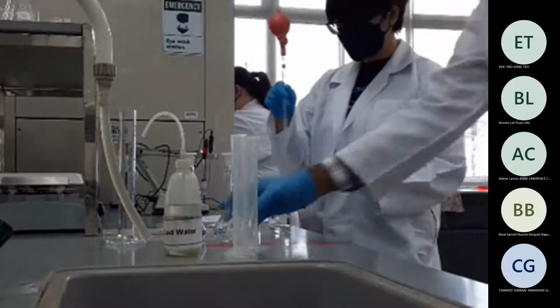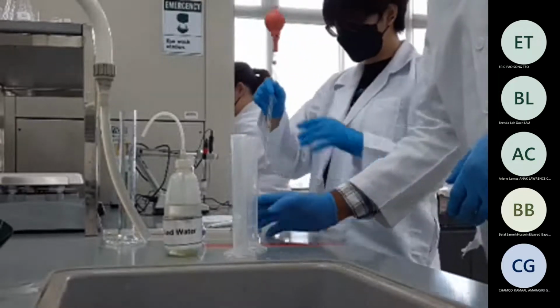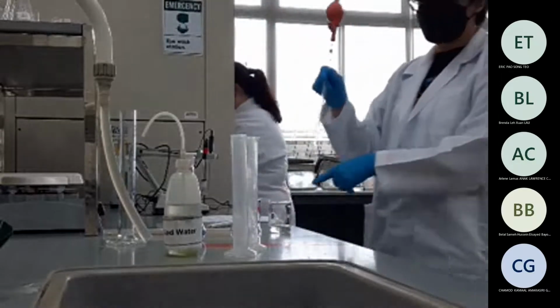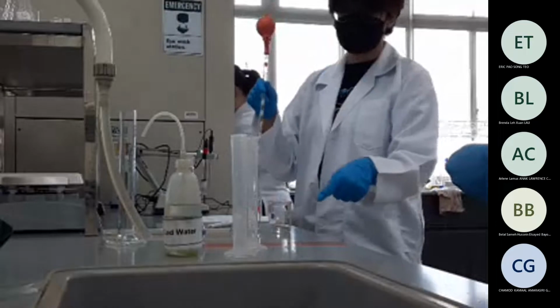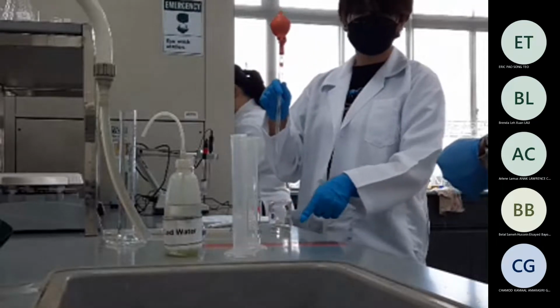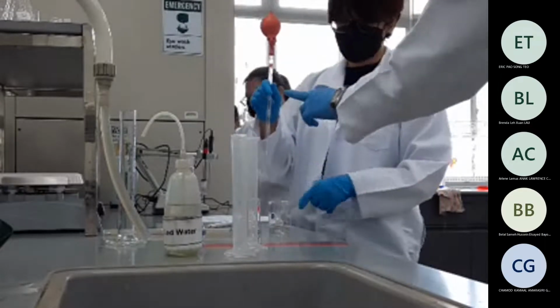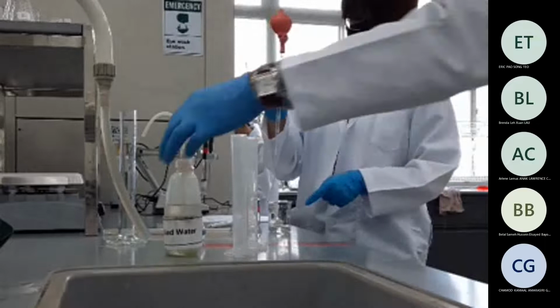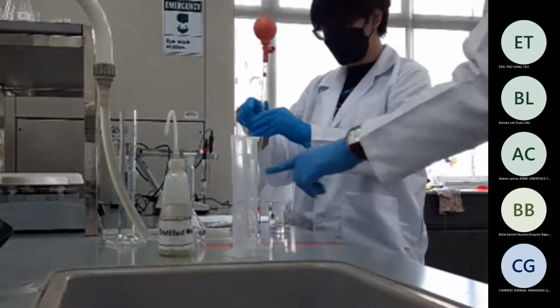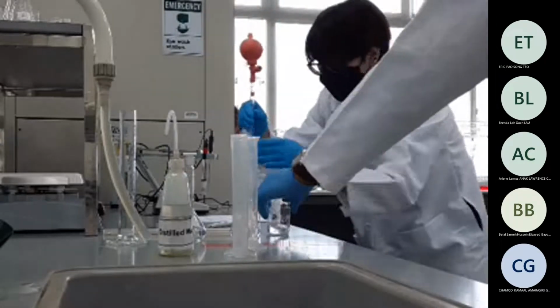Yeah. So you need to label as well here which one is what, otherwise you will mix them up. Later after I pipette the HCl into there, do I need to also rinse it with this? You have to rinse it with the water first. Rinse with distilled water, and then you have to rinse it with this acetic acid.